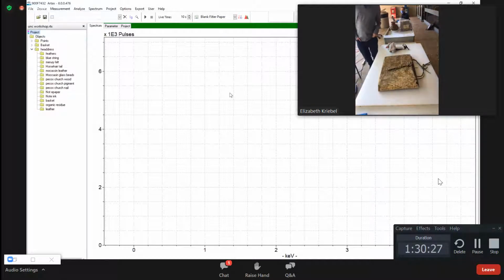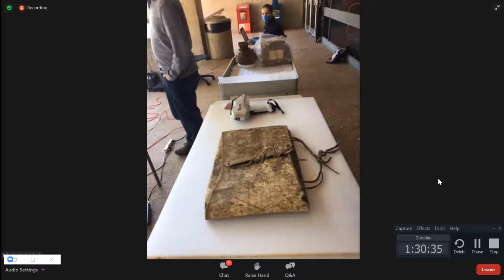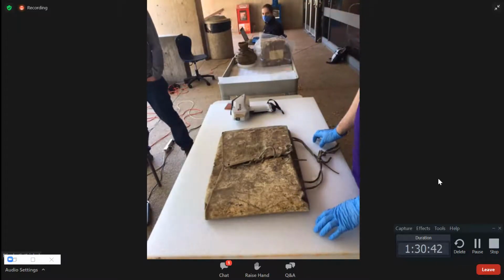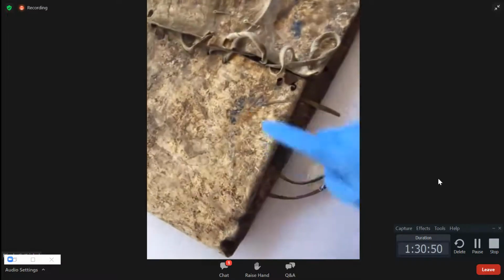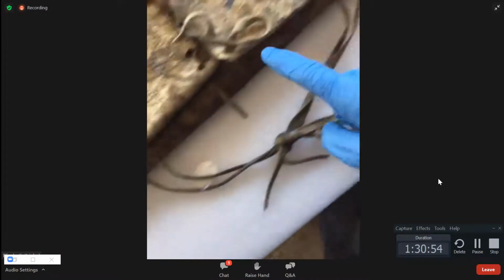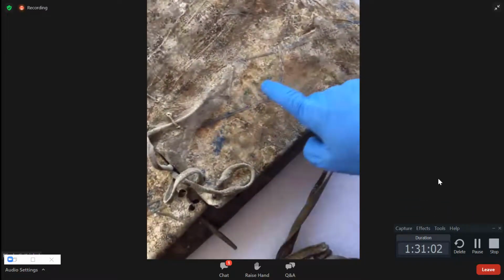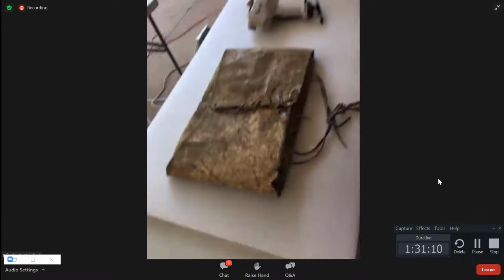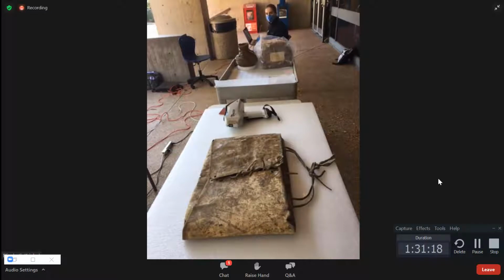For those of you, are we still screen sharing on you? Let me turn this off. Okay, so here we have a parfleche, date unknown, probably late 1800s, early 1900s potentially, and I think I'll use the camera for the object. It's kind of rough, it's been used. It's got remnants of some blue coloring here, remnants of the design. You see this diamond pattern here, the zigzag, with blue and then some green long stripes. So remnants of blue and green, and this pattern here. We're looking for whether we've got arsenic in this or not, or lead or something. But we might pick up, as he just mentioned, some ingredients of a blue or yellow or whatever.